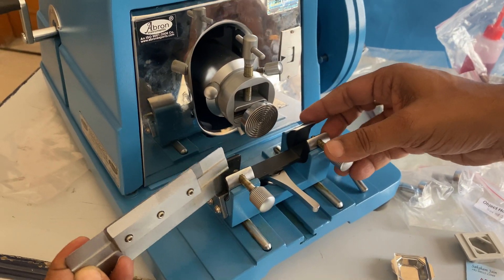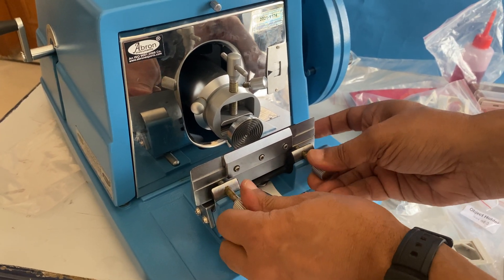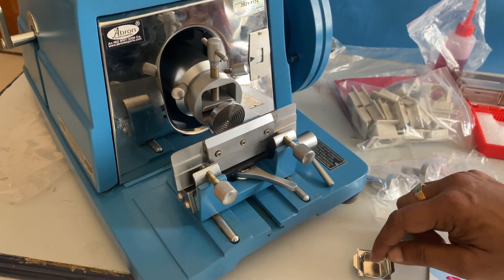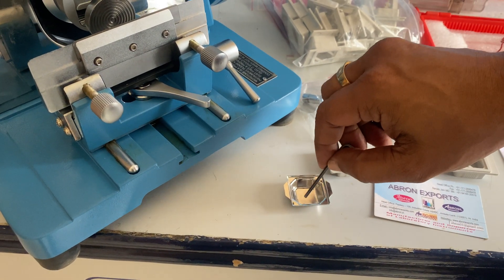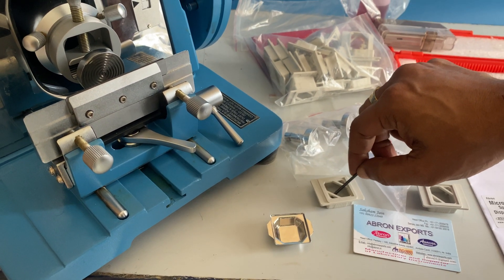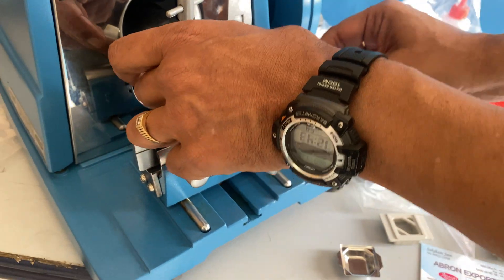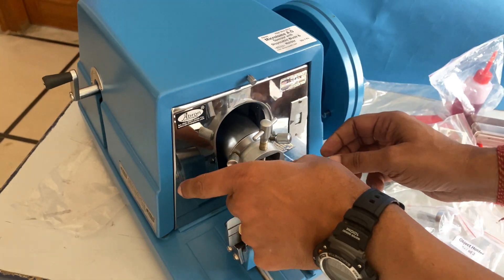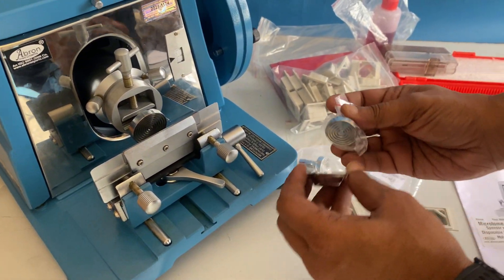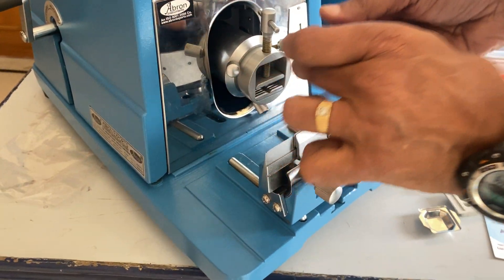There is a block holder here. You tighten this blade holder and then you can adjust. Put the sample of the tissue here — put wax from the wax bath; there is a plastic one and a stainless steel one. After the sample is completed, you take out the block and attach it to the sample holder, and then you can take out the sample.